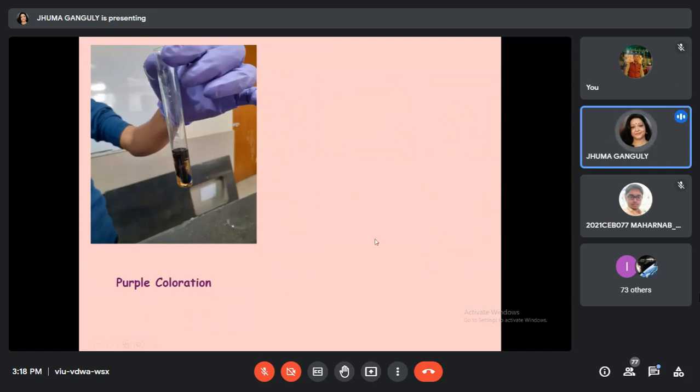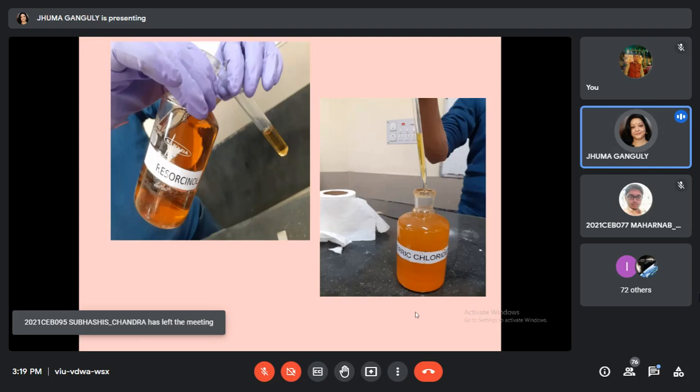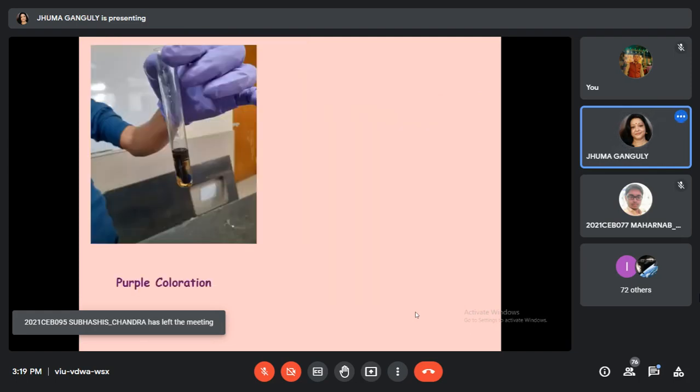Now ferric chloride, sorry, another. This is ferric chloride. We drop pipette it out, and the ferric chloride is like this. If you go to the aqueous solution, it will be clear, but if you put it in ethanol, it's not so clear. It is a colloidal suspension type material, heterogeneous, but it also works for the reaction, because after that an anion is formed and it's soluble in ethanol.